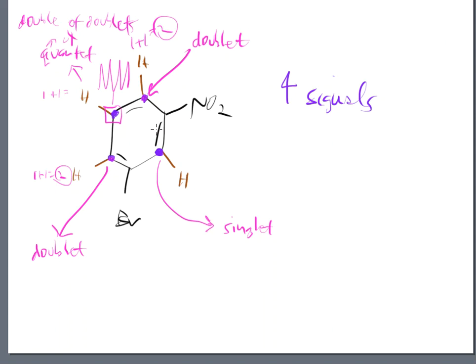A bromine, an NO2 group, an OH group, something on that molecule is making it different for those 2 CHs, which are otherwise the same, CH and CH. They are different. Chemical shifts are different, which means something else is on the molecule on that kind of electronegativity scale that's pulling on one side and not so much on the other, and they are chemically different because of that.